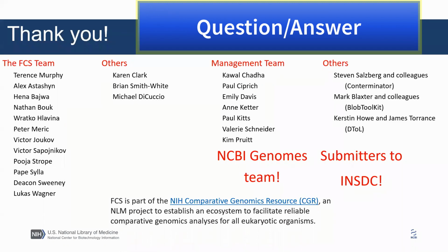So that leads into another question that we have, which is the background database for GX. So it must be already cleaned up. It's different than the BLAST database, for example. Yeah, so we have made a lot of effort to do cleanup, both, like I mentioned, through manual validation and automated pipelines to identify what are going to be very high confidence contaminants that should be removed from the database. I can't claim that it's perfect. It would be really difficult to make that claim.